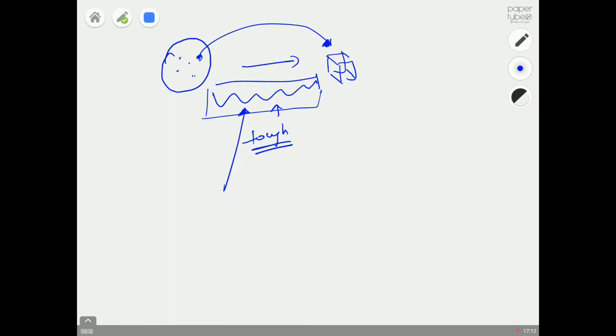And then what else can we see? Time to time throughout the lectures, I'm going to show you how industries are exploiting this crystallization technique, what type of experiments, processes or trials they perform when they decide to purify a particular product.